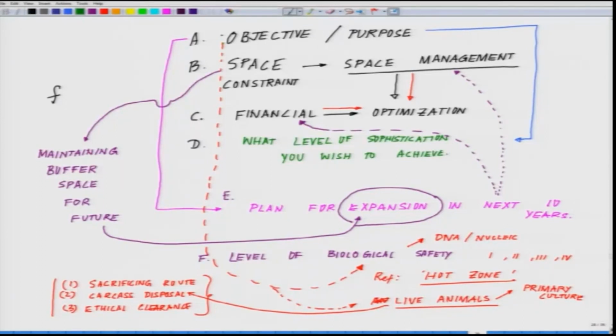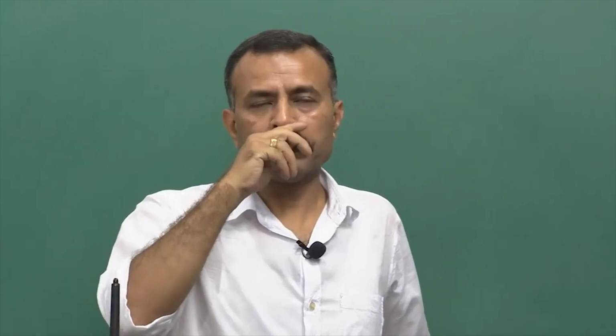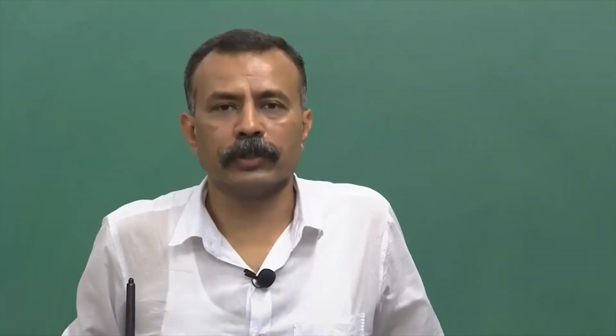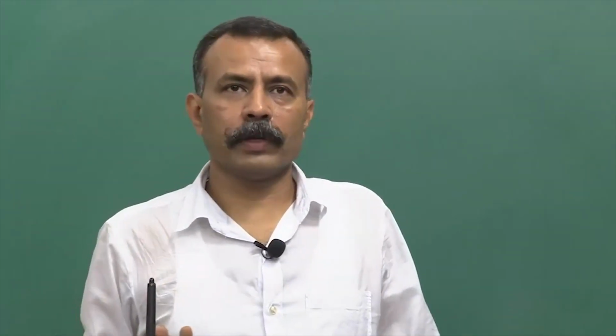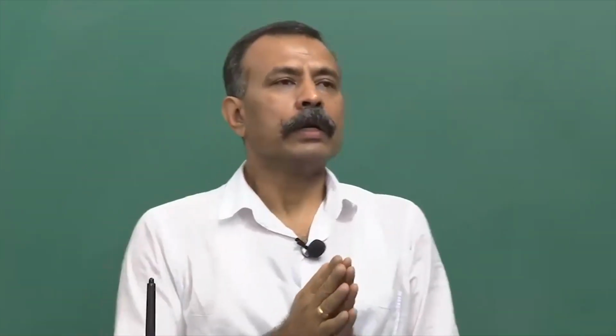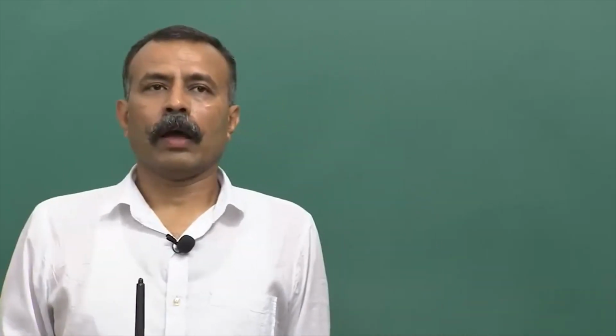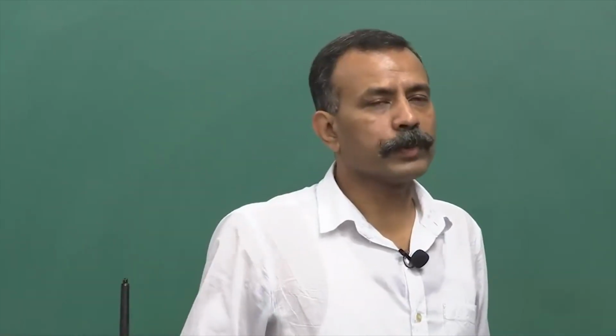From here, now we will talk about some of the precautionary measures that have to be taken even before you start thinking about the layout. Realize one thing: say, for example, you are designing a building, which is a far bigger facility and needs a different level of security.